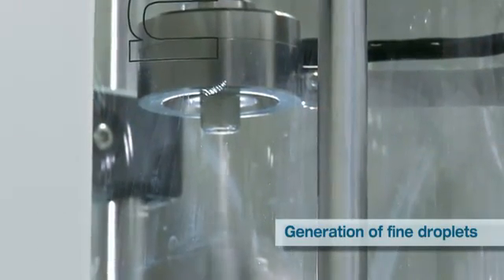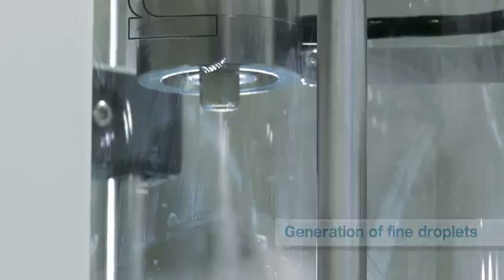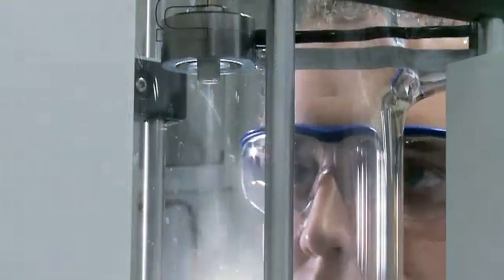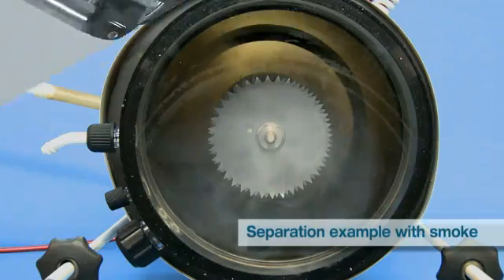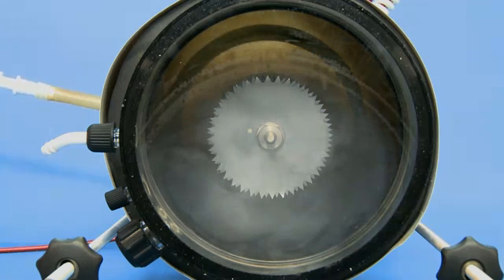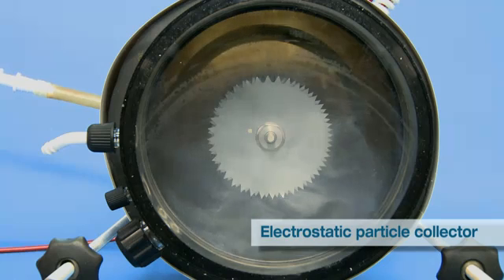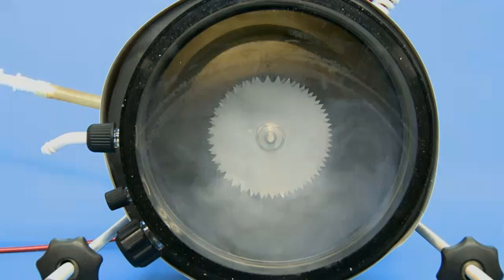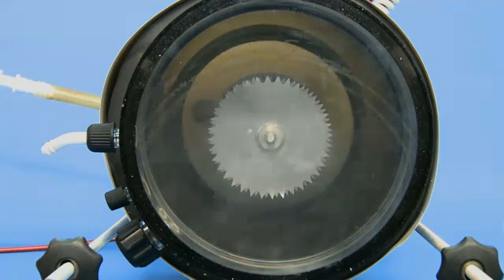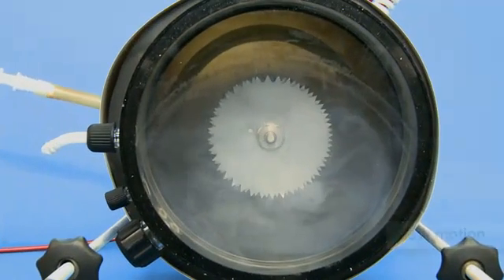The piezo electric spray head is producing fine droplets with a narrow size distribution. These droplets then get gently dried in a laminar heating gas stream. The dried particles are charged on the surface and deflected in an electrical field. This unique high voltage separation technology allows separating even the finest of particles from the heating stream with high yields.